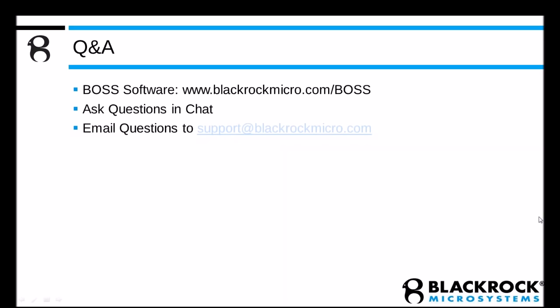Nick, there's also another question, maybe for you or Silvana. What does the clustering tendency grid indicate? What is the calculation behind it? The clustering grid is an algorithm that attempts to indicate whether there are clusters in the data and looks at how well separated they are. It looks for separation between clumps of points. After performing this calculation, you get a coefficient from 0 to 1, and that 0 to 1 is the percentage darkness of each of those cells that we saw in the matrix.